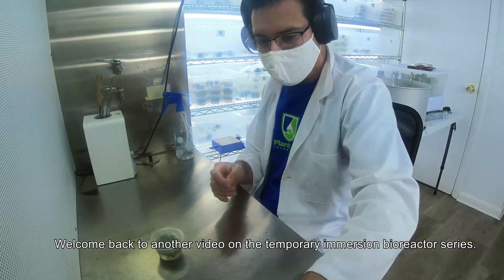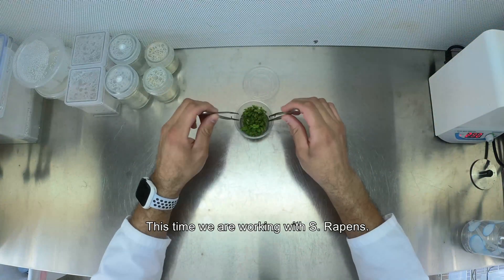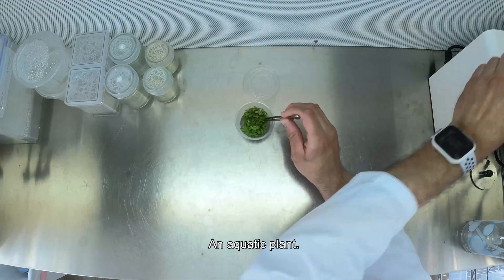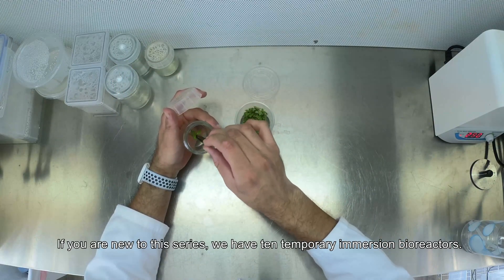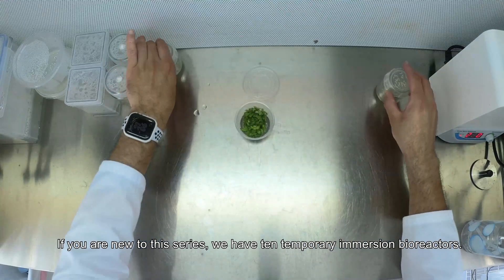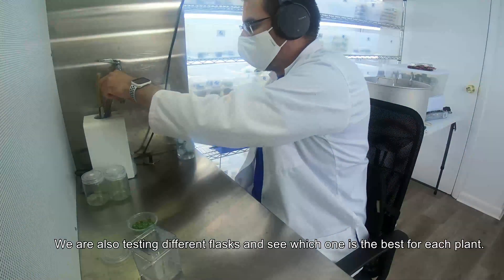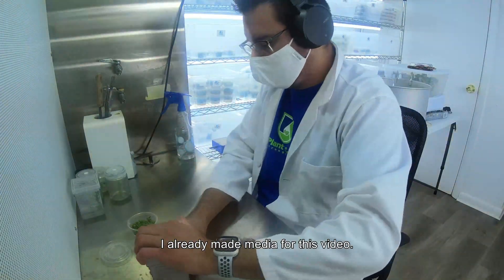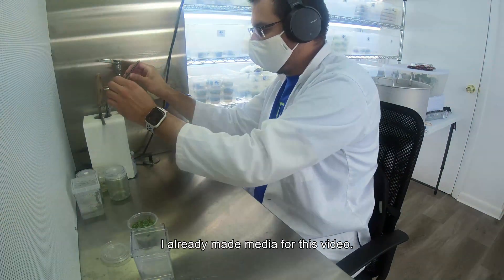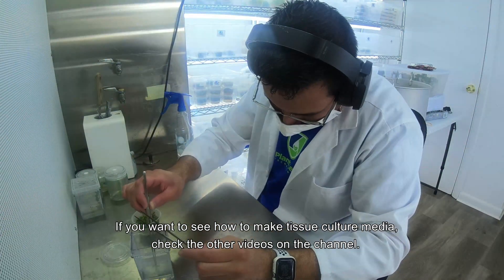Welcome back to another video on the temporary immersion bioreactor series. This time we are working with S. wrappings, an aquatic plant. If you are new to this series, we have 10 temporary immersion bioreactors and I'm filling up one at a time every two weeks. We are also testing different flasks to see which one is best for each plant. I already made media for this video — if you want to see how to make tissue culture media, check the other videos on the channel.